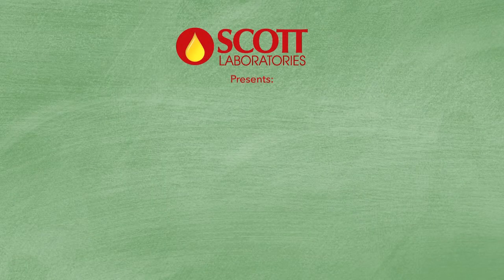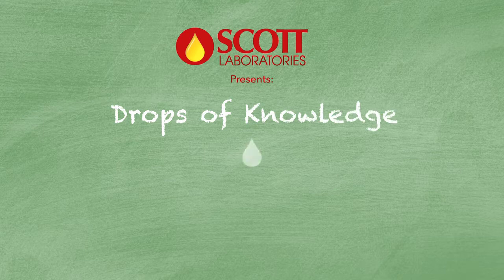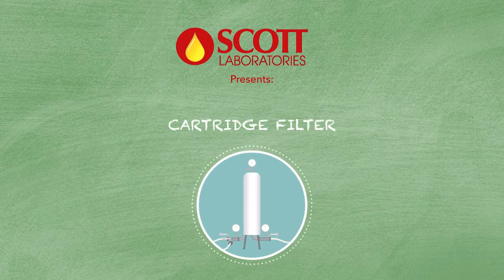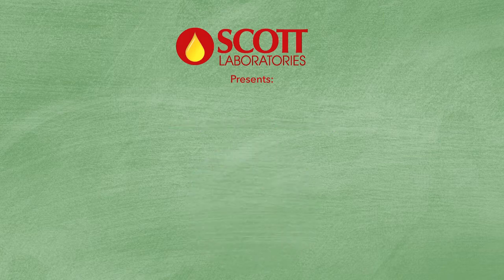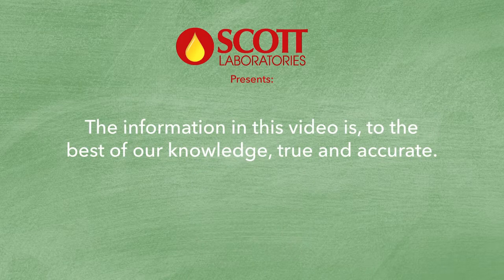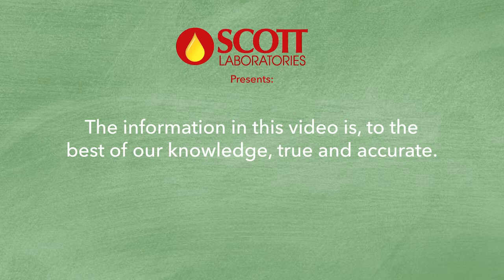Scott Laboratorius presents Drops of Knowledge. In this video, we'll be reviewing setting up a cartridge filter housing, testing membrane integrity through the bubble point method, product filtration, as well as cartridge cleaning, regeneration, and storage.